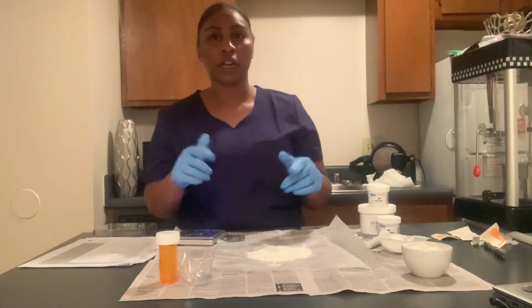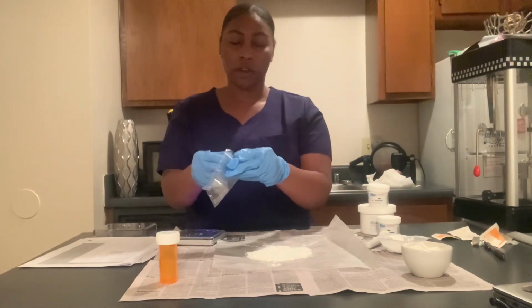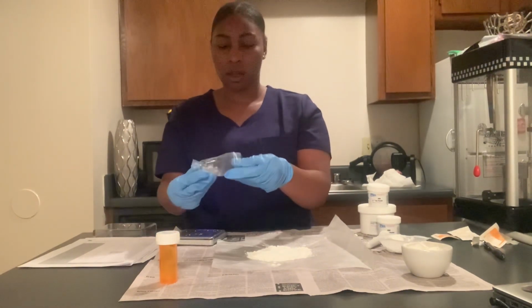So we're going to do the punch fill method to fill our capsules with our ingredients.